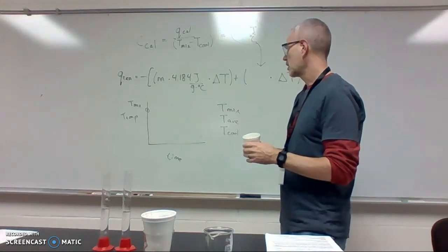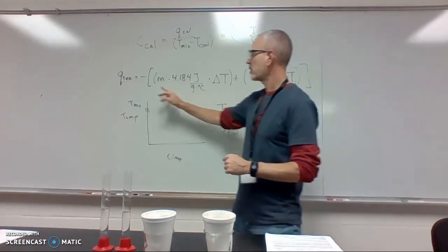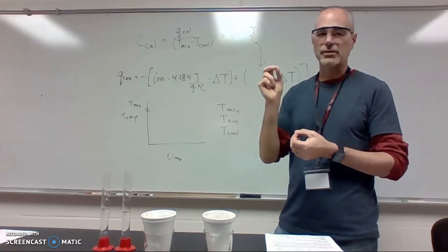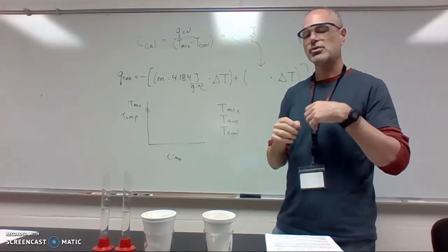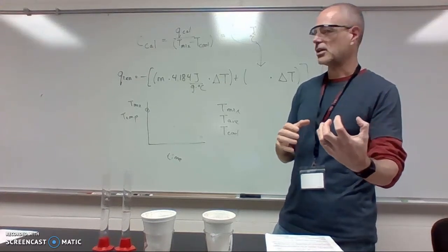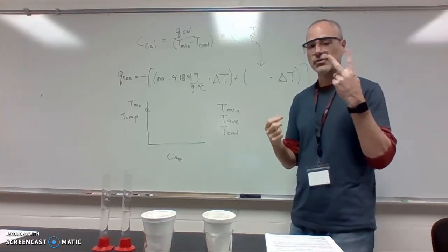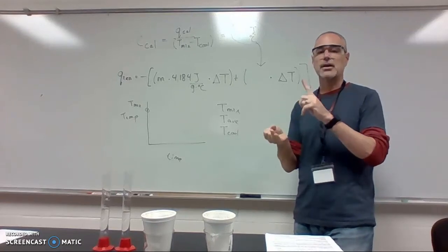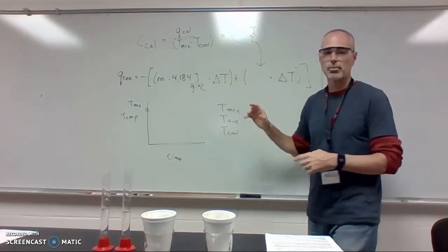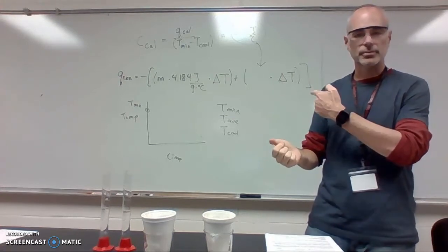Having the T mix, with that part there, you can go through and take a look at this reaction. So let's talk about the negative sign. The negative sign is just a fix. It's not really mathematical. It's a fix demonstrating this is the energy released by the reaction. So if the energy is released by the reaction, it's the same amount of energy, conservation of energy, that is absorbed by 2 things, the water and a cup. So here's the water portion, and here's the cup portion. Remember, we're assigning all that energy loss that we expected to the cup.